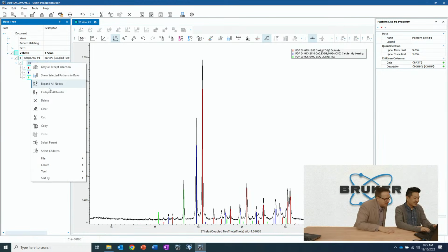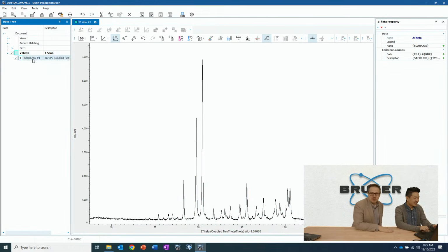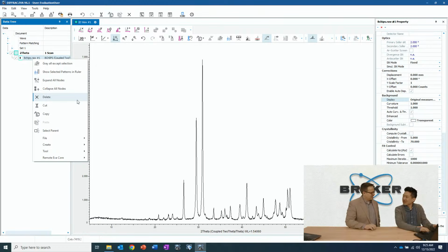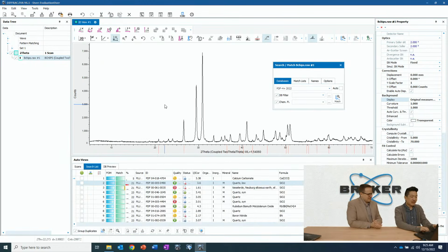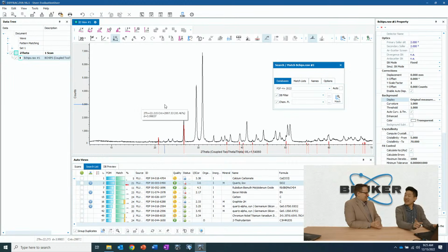Yeah. So we got dolomite, calcite, and quartz. Let's see if we can get something close. I'm a little bit of a skeptic, right? Because in terms of things like self-driving cars or the self-parking ones, I hate parallel parking. Yeah, it's good, but you should guide it a little. Yeah, okay, I generally do.